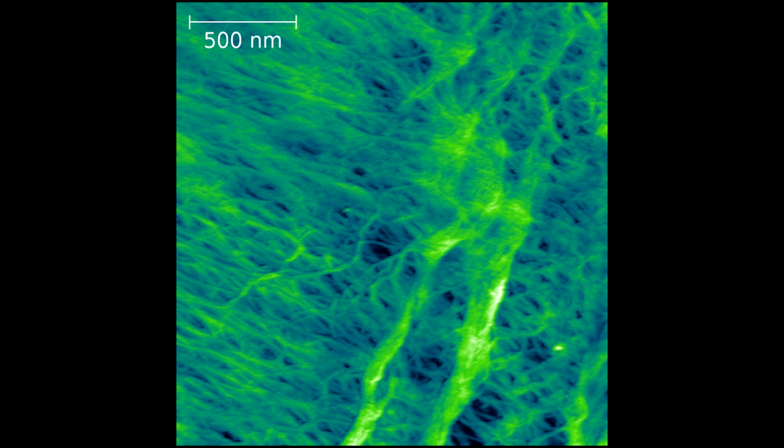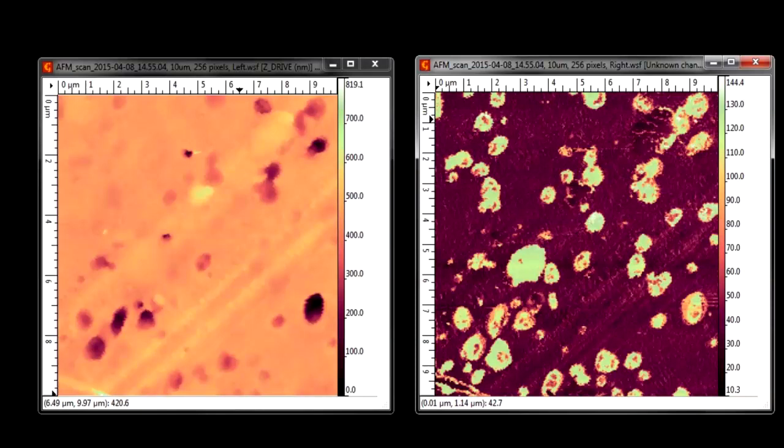The TT2 AFM is ideal for distinguishing characteristics of polymers. On the left is a topography image, which allows for measurement of surface features. On the right is a phase image, which allows us to visualize components of the polymer.